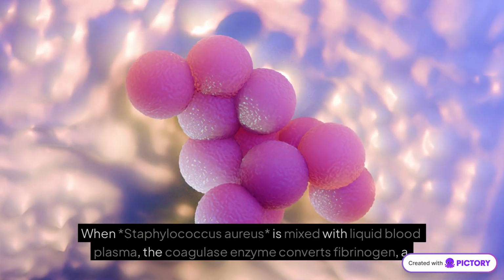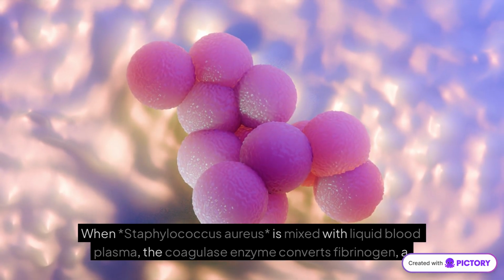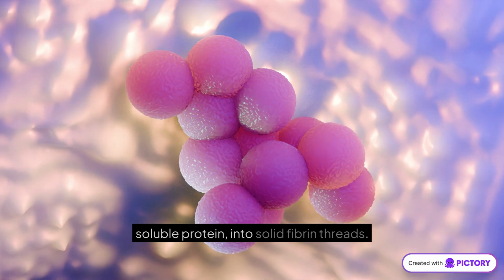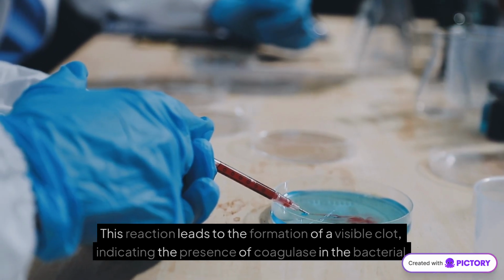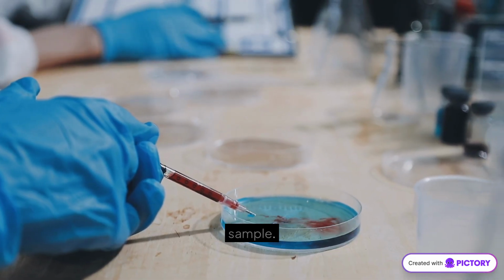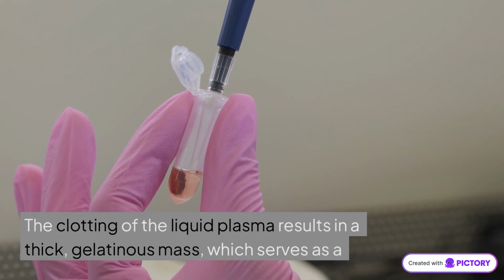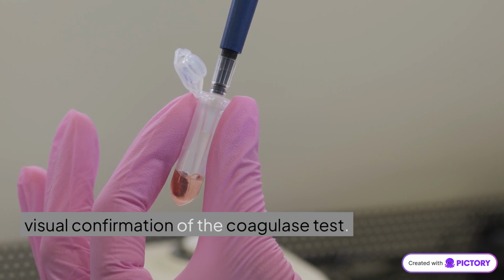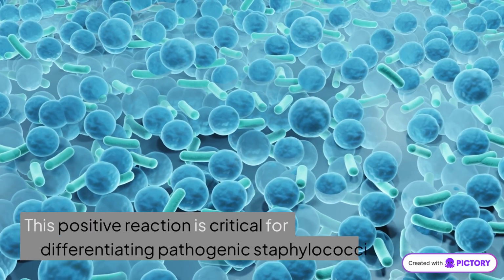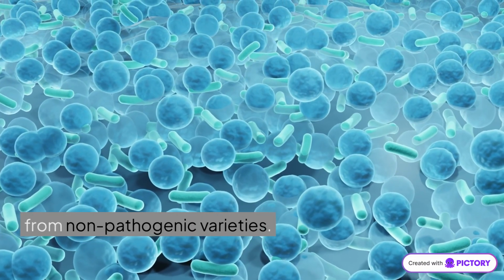When Staphylococcus aureus is mixed with liquid blood plasma, the coagulase enzyme converts fibrinogen, a soluble protein, into solid fibrin threads. This reaction leads to the formation of a visible clot, indicating the presence of coagulase in the bacterial sample. The clotting of the liquid plasma results in a thick, gelatinous mass, which serves as a visual confirmation of the coagulase test. This positive reaction is critical for differentiating pathogenic staphylococci from non-pathogenic varieties.